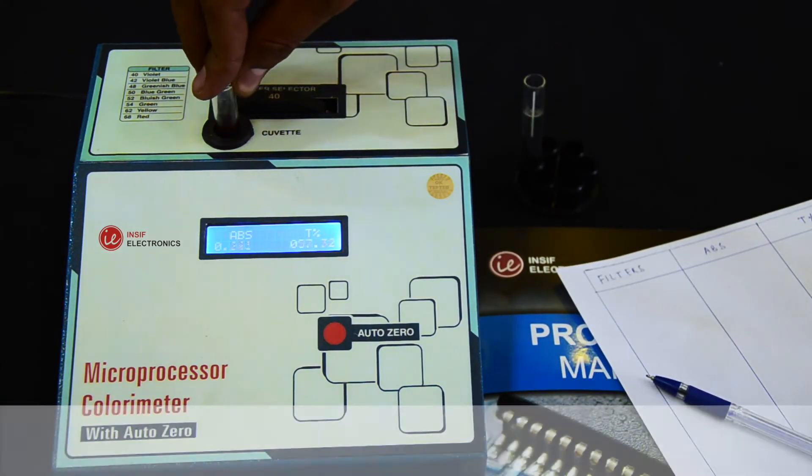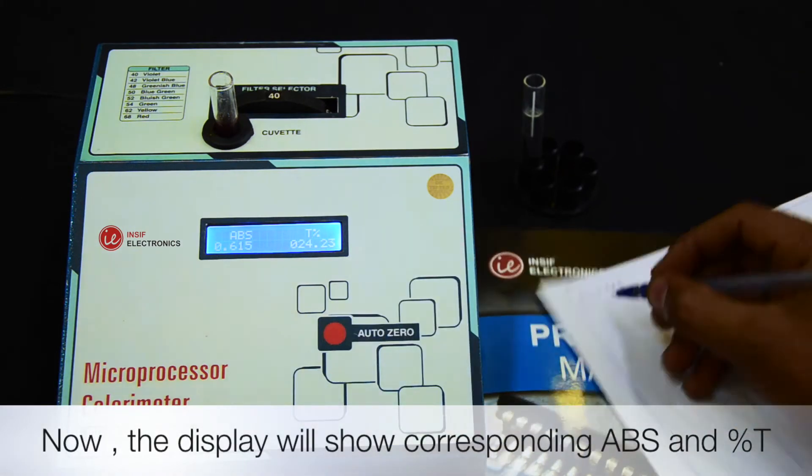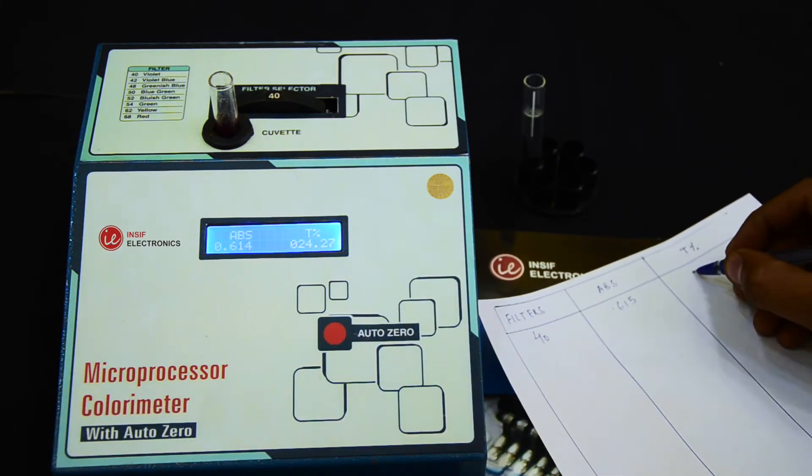We are taking cobalt chloride as a sample. Now the display will show the corresponding absorbance reading. Note it down.